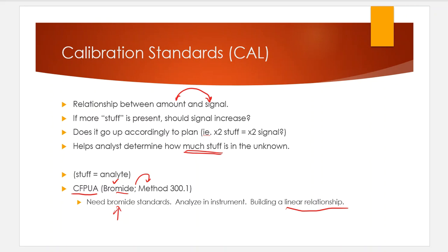Very important to have those clean on hand. A lot of those calibration standards, at least the strong ones, are ordered. The strong ones are typically ordered through third parties, and that could be through a company like VWR, it could be a company like Fisher. There's a whole series of different third-party companies out there that will make these standards or sell these standards to a company so that way they can use them to make their calibration curve with.